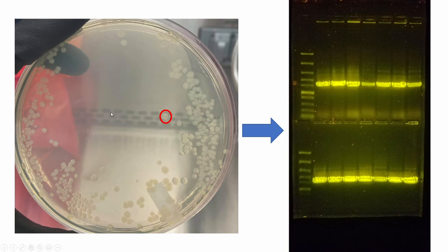But basically, the first step in doing this expression is actually starting with a colony PCR. That's where we touch one of several colonies and test them using PCRs, very similar to what we did in our first lab or second lab.